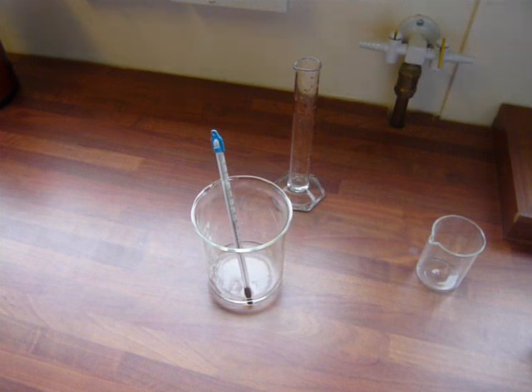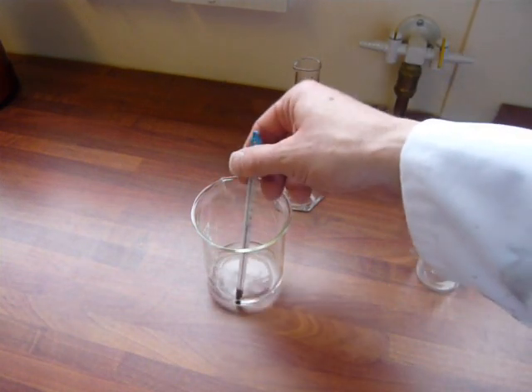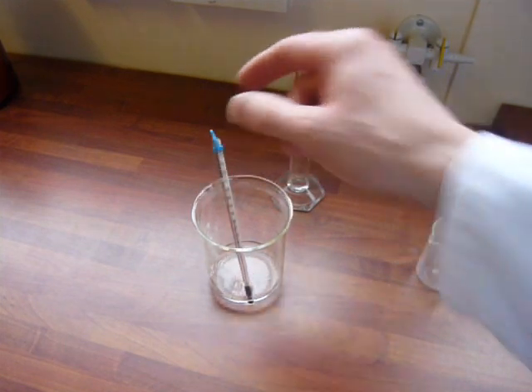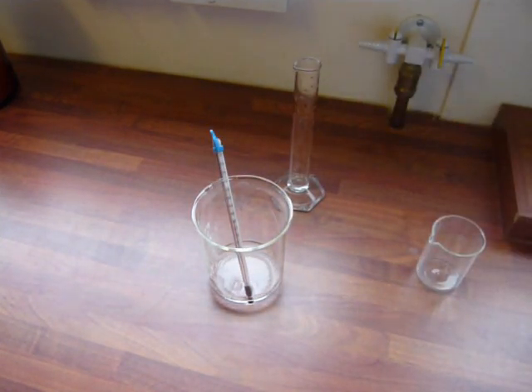Incidentally, in a recent exam question, they did an endothermic reaction, that's one that gets colder, it takes in heat from the surroundings. So when people were asked to improve the apparatus and explain why, they had to say you would use an insulator rather than a glass beaker, and this would reduce heat coming from the surroundings. But in this case, an exothermic reaction, we are losing heat to the surroundings, and so we won't get very accurate results.